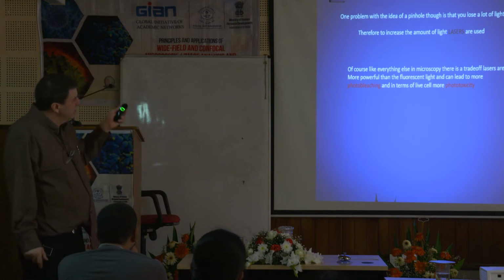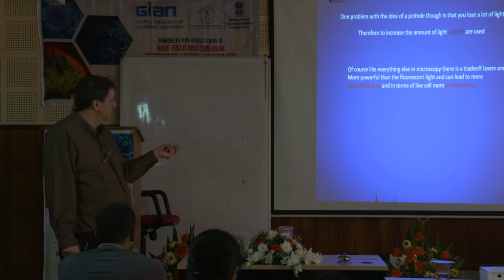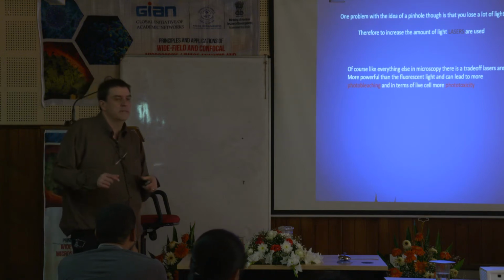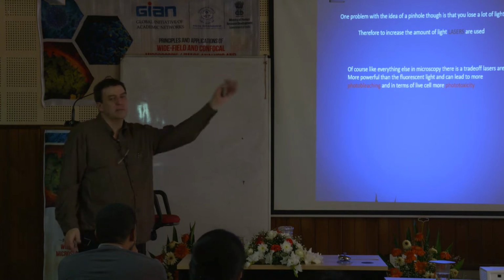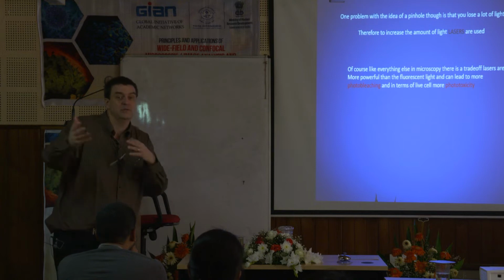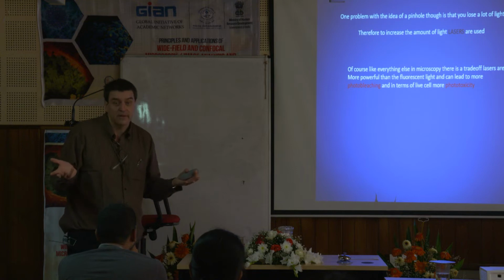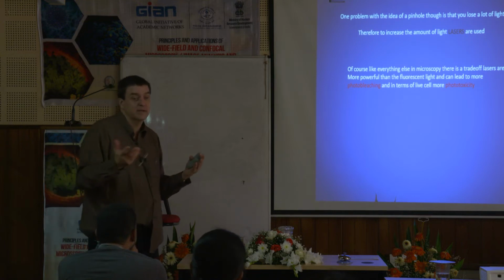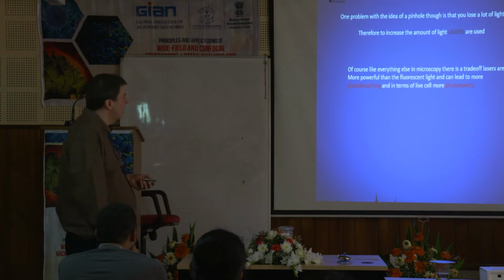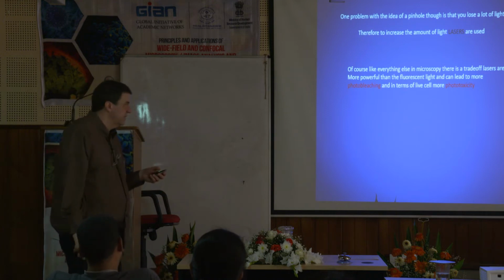Okay, but when we start talking about live cell imaging, you got to be careful with your lasers too, because there's the problem of phototoxicity. Okay, so basically what phototoxicity is, like let's say we leave class today and we go down to the beach, right? I'm going to get sunburned really, really quickly, whereas you all have a little bit darker skin, you will not get sunburned quite as quickly, right? I mean, I'm white, I'm coming from the north, I'm coming from the land of snow, and I'm going to burn. Well, when you're hitting cells with UV light or fluorescent light, you're burning them.